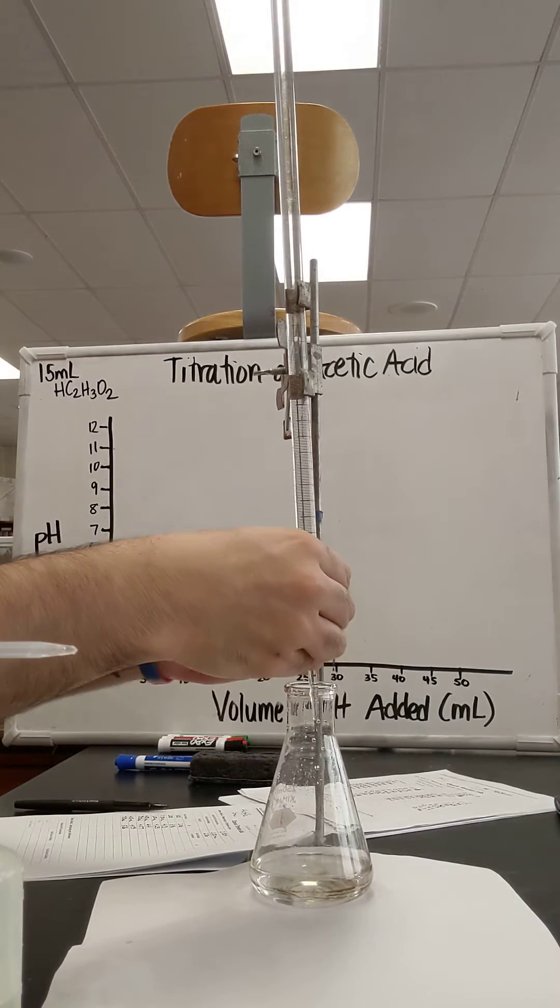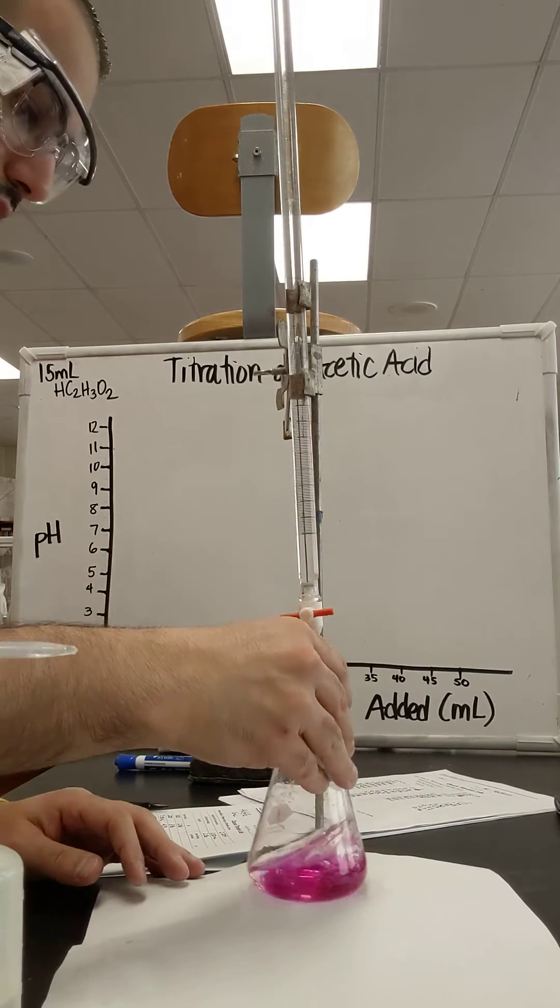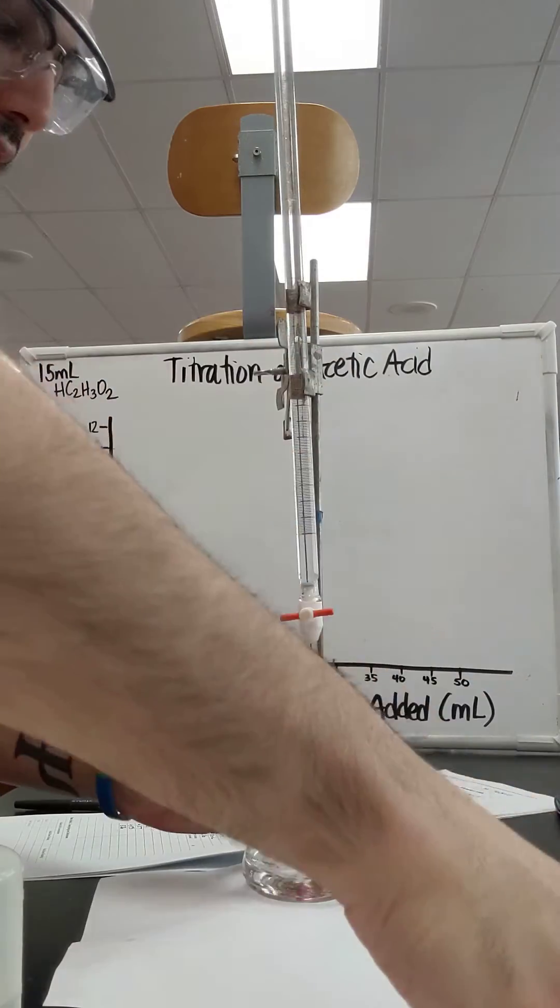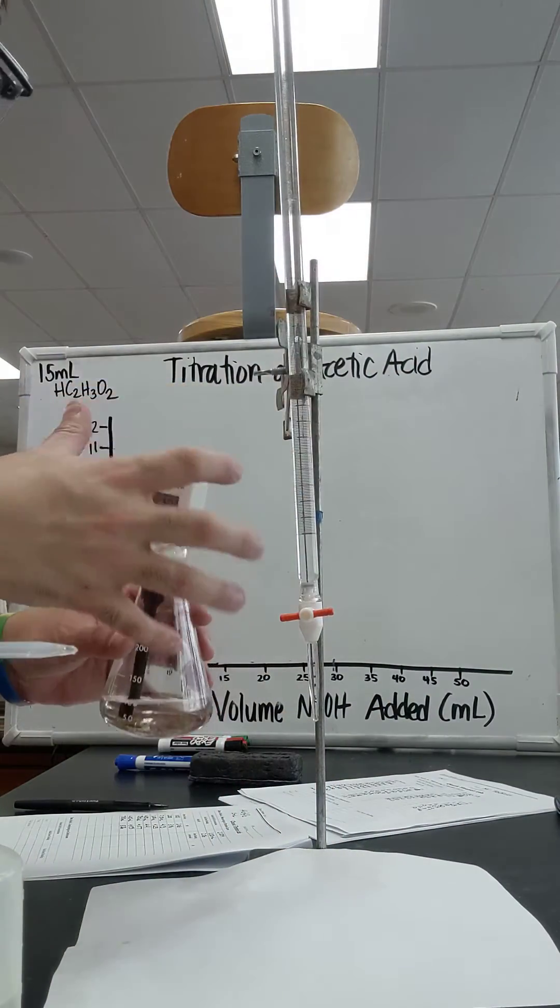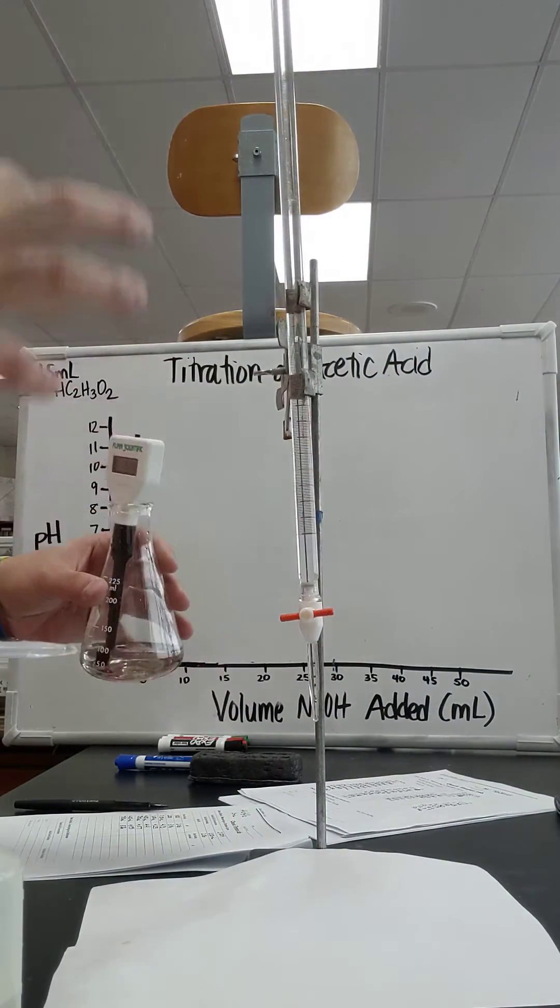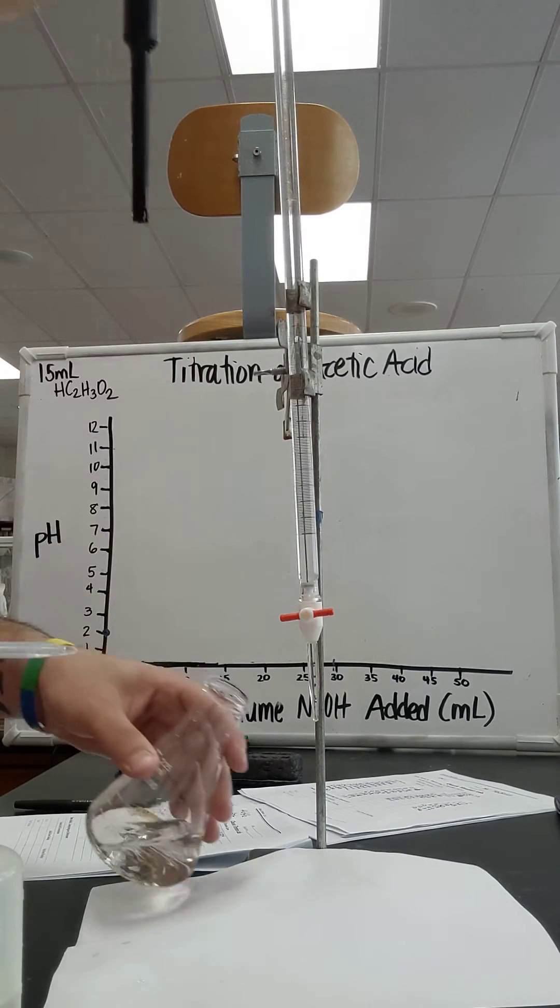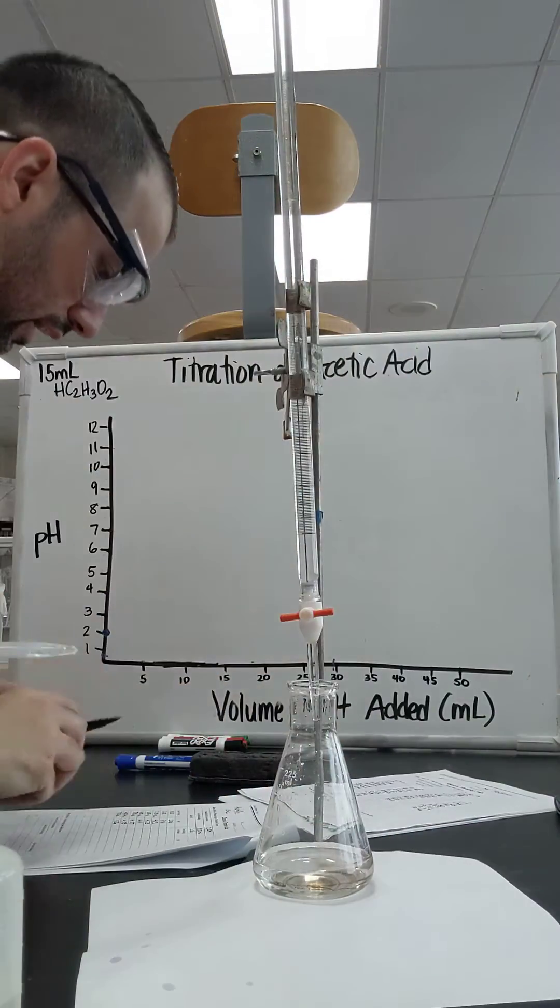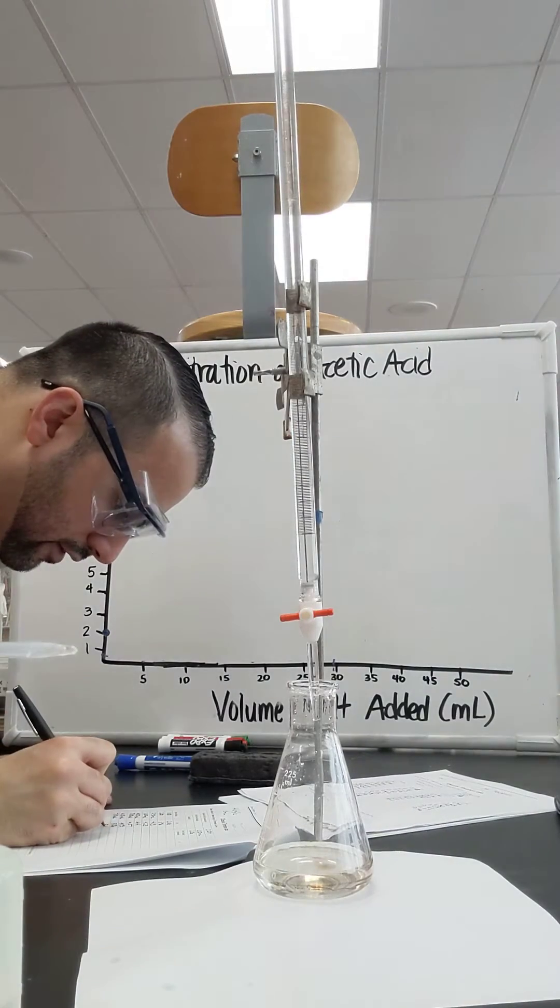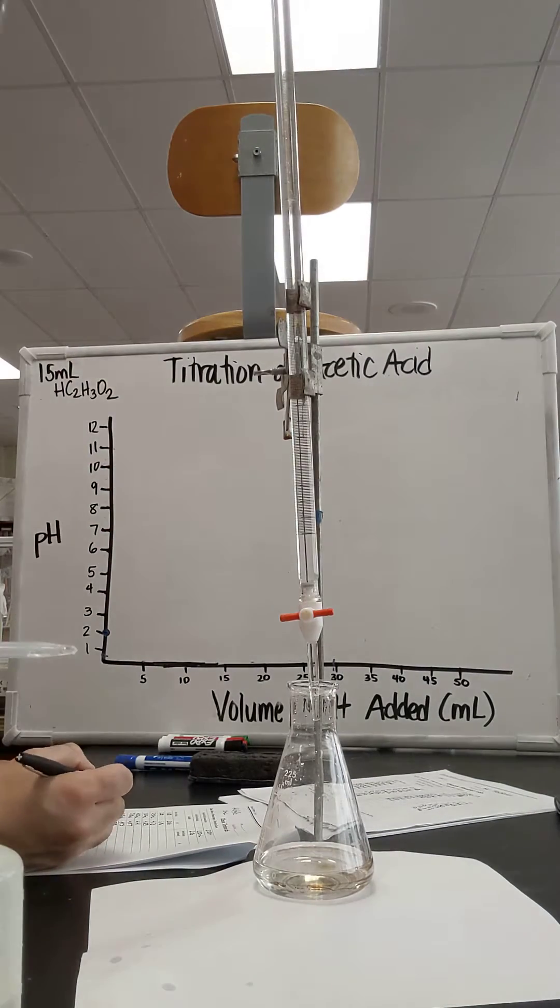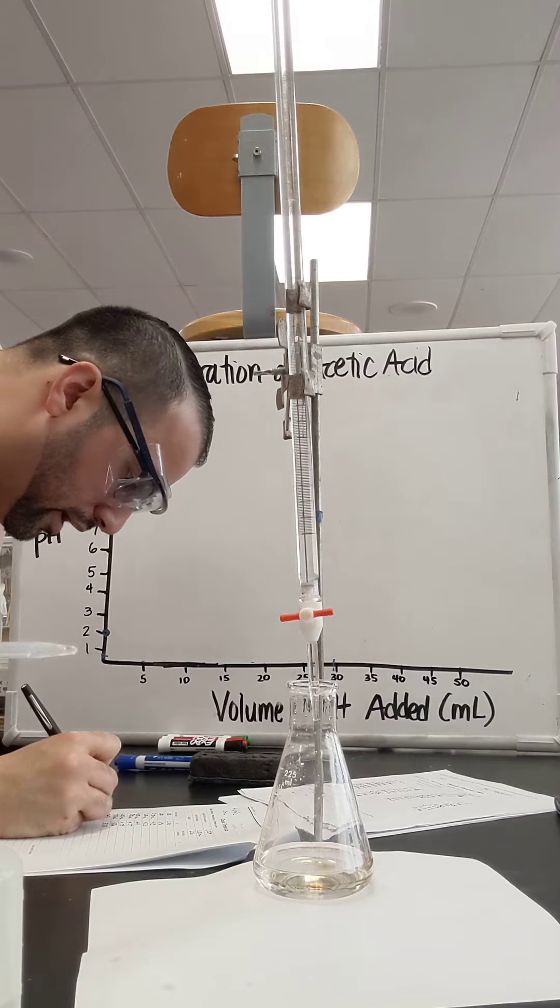Let me do another 0.5, actually. I got 7.5, it was getting darker. Once you notice that big pink color coming around, that means you're getting very close to your end point. I got 5.28 is my pH. I got a steady increase. And I got 7.5 milliliters approximately.